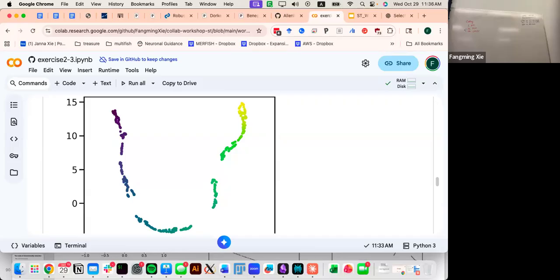So I could use that one and that one too, because it's still running. Let me try to kill this. Okay, so we can run that. Oh, now it might be because it was trying to run the other one. Right. So let's try. That took four minutes or so.